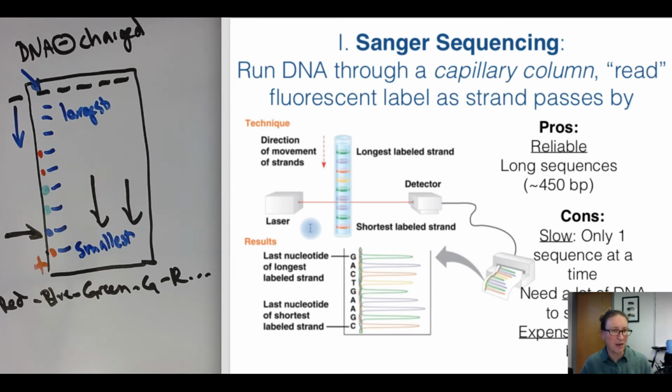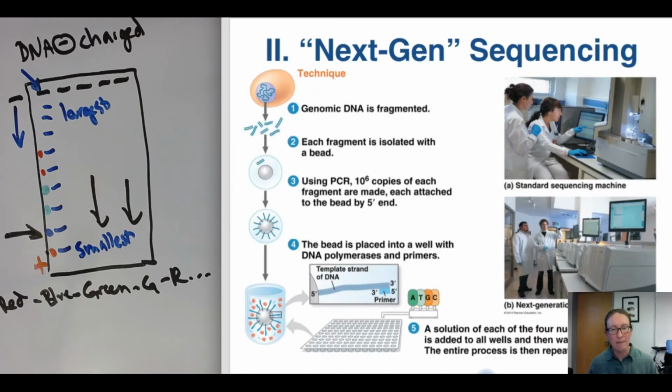And if you start looking up how large different genomes are, you're going to discover that's going to get really expensive in a hurry. So part of what that means is that people had a lot of motivation to figure out other methods to sequence DNA that were a lot cheaper and faster. So that brings us to the technique of what's now referred to as next generation sequencing, to contrast with Sanger sequencing. For next generation sequencing, some of the principles are related, but the fundamental process is different.